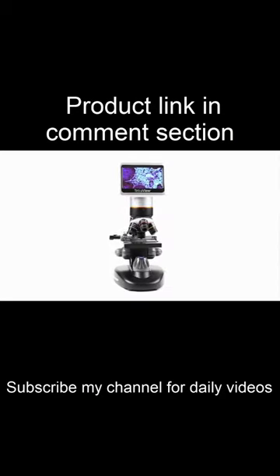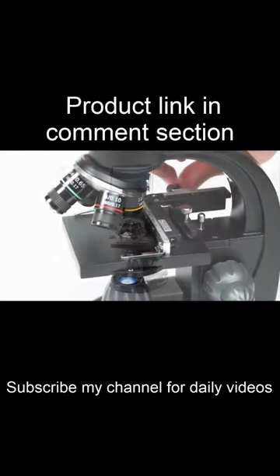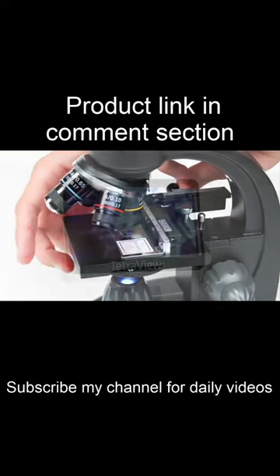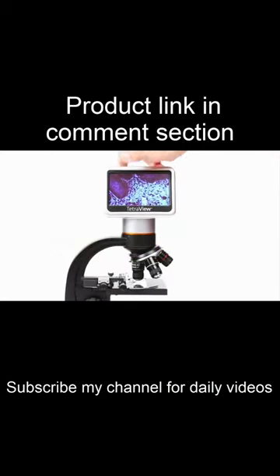Examine specimens in sharp detail with Celestron's new TetraView LCD digital microscope. View subjects on Celestron's largest microscope display — the 4.3-inch touchscreen rotates 180 degrees to share the view with others.